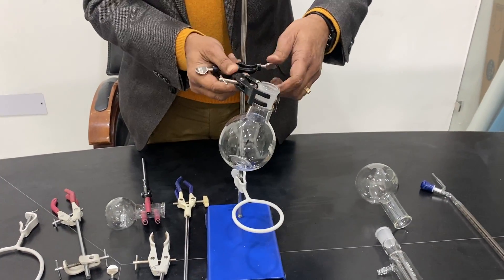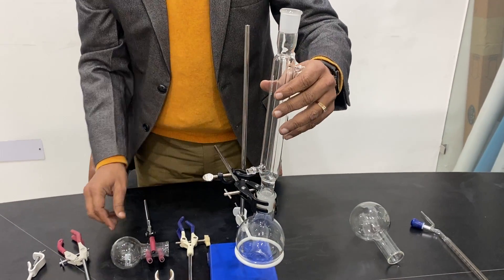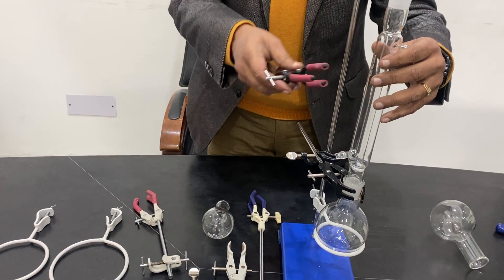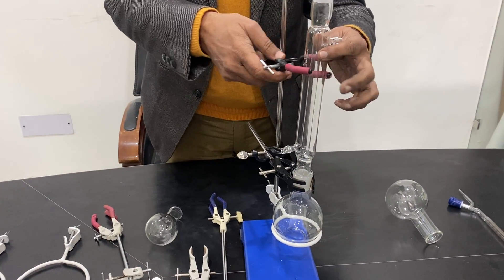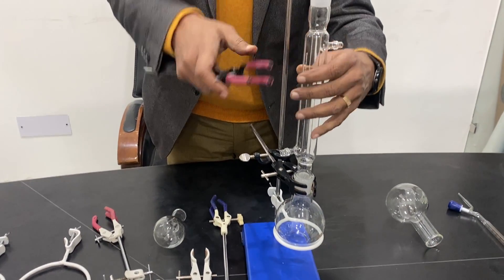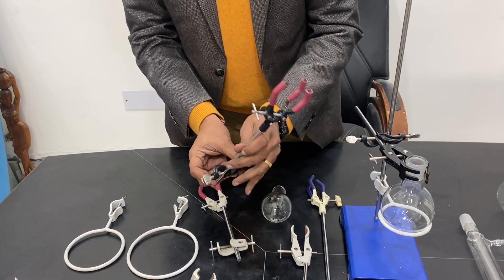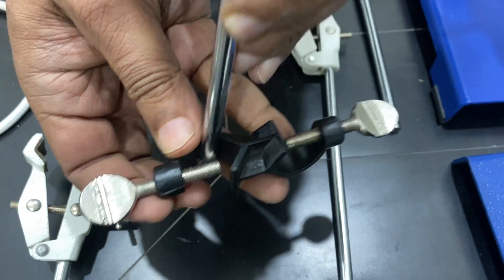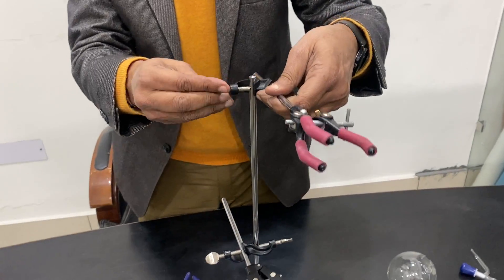Let me show you once again how to fit it and hold the condenser. This is a condenser — you can also hold a flask with this clamp. This is called a three-finger clamp; there are four-finger types as well. For holding a condenser, people mostly use the three-finger clamp. Open it and then tighten it this way. There is a boss head — you can put it on this side or the other side, both ways work. It is most commonly used on the top side and is very easy to fit.